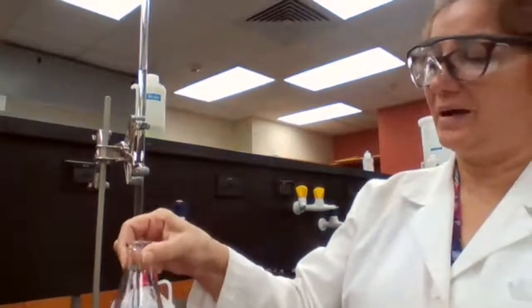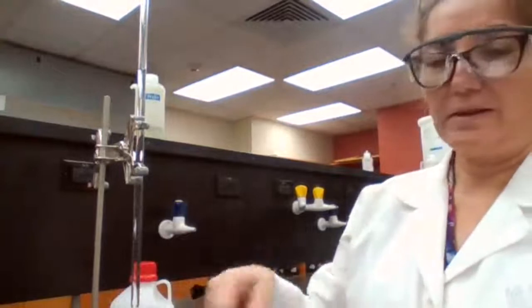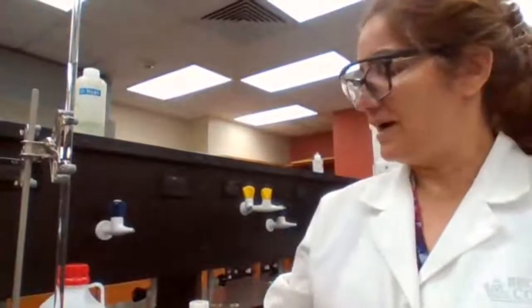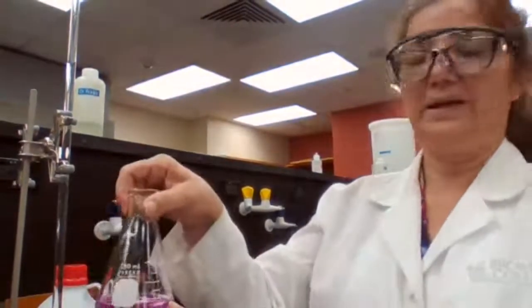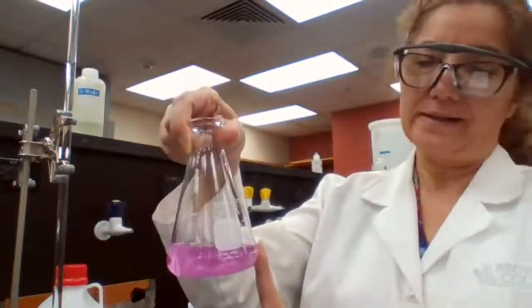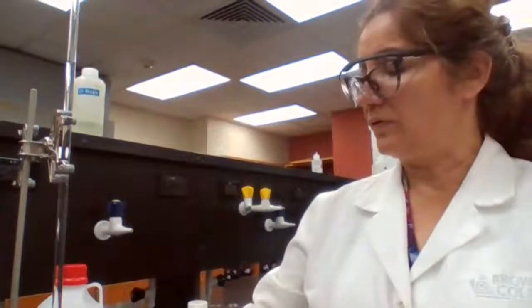So we find out when you calculate the molar mass, it is slightly different than the molar mass for benzoic acid. You can explain in your conclusion the dark color that you got for the titration. Any questions about the equivalence point?